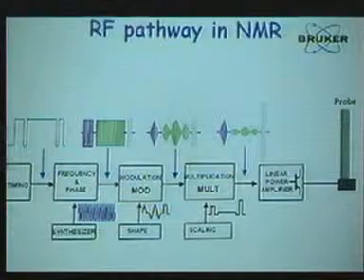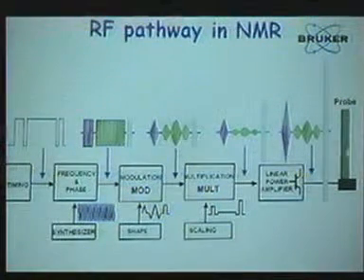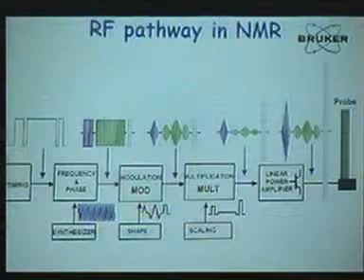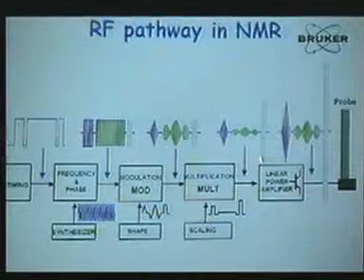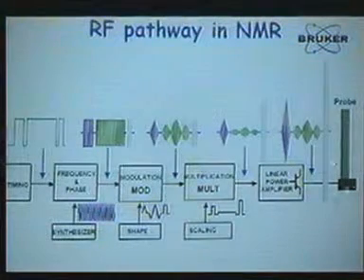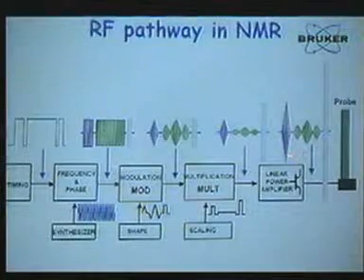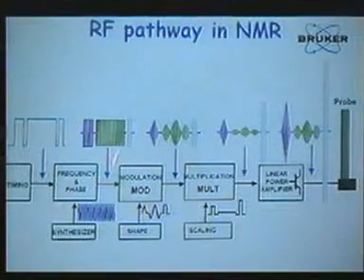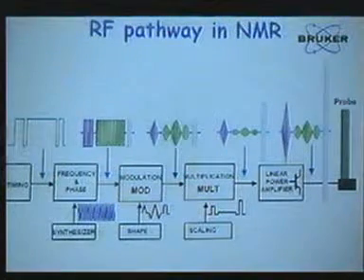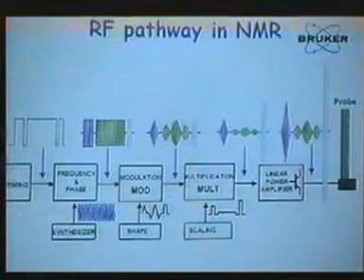Next. And this is basically what the probe and your sample are seeing. And if this probe is much more sensitive, as I just explained, then it will be much more sensitive to anything wrong here. And you see that there are many steps that can go wrong. This is one step, etc. So we have to take care that all of those steps are very well taken into consideration. Next.